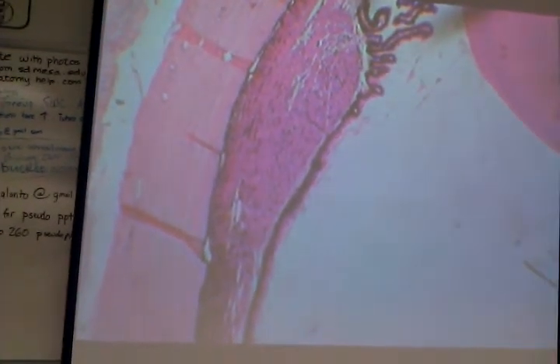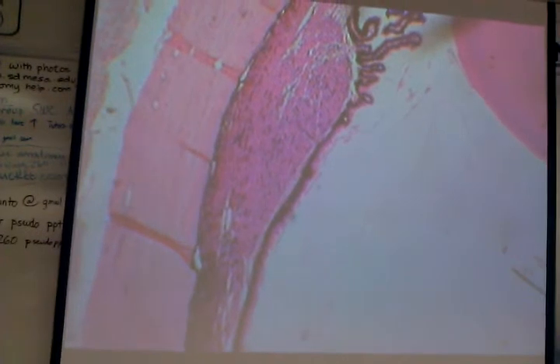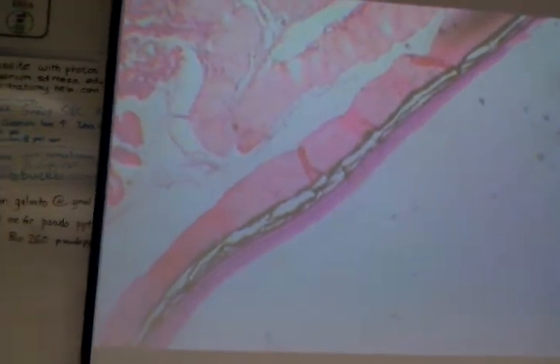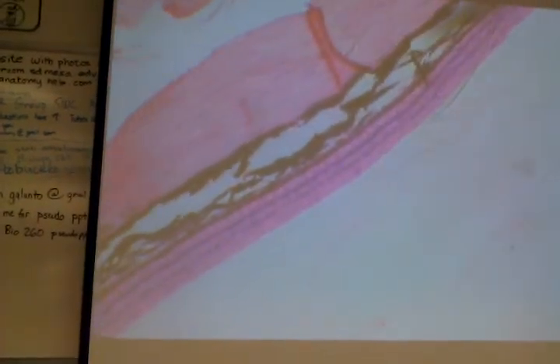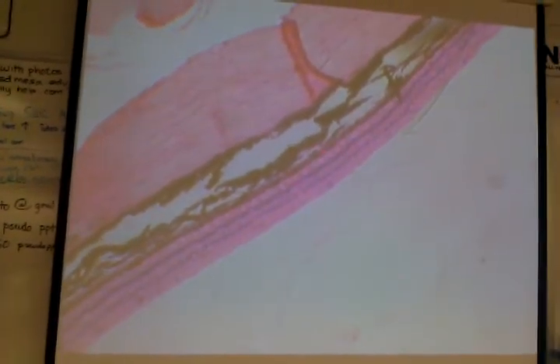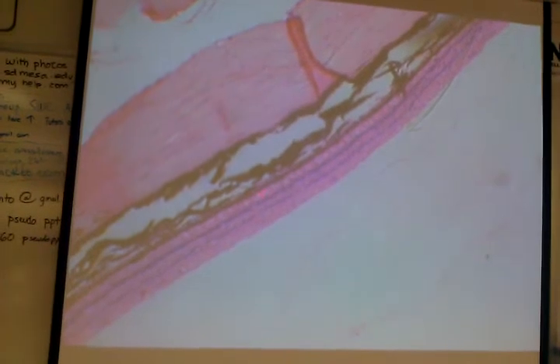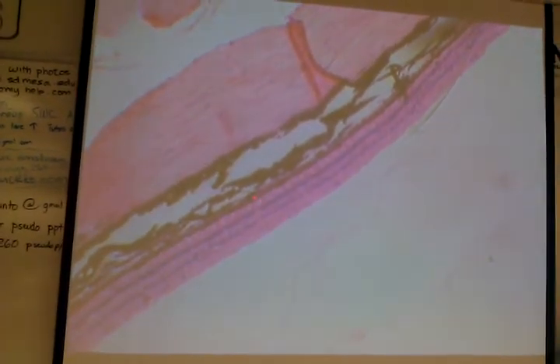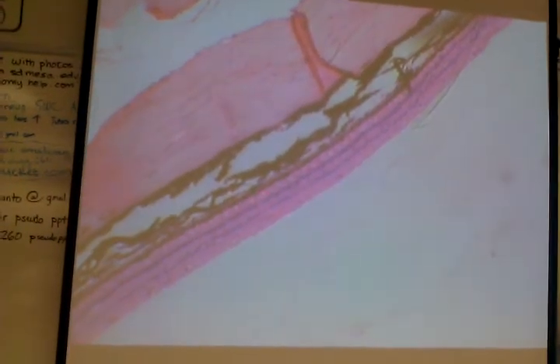But let's look further back in the eye so you can see what it looks like. So if we go back a little further, let's find a nice spot right here. And go to higher magnification. So right here, this layer, from where my pointer is to right here, and we'll look at this in a better picture in a minute, this is the neural layer.